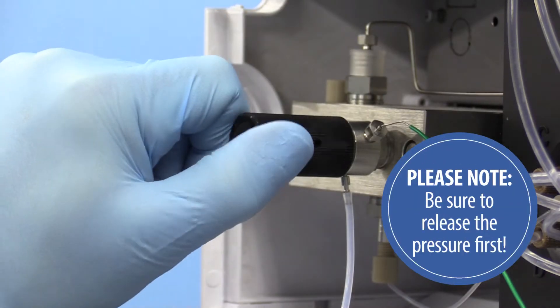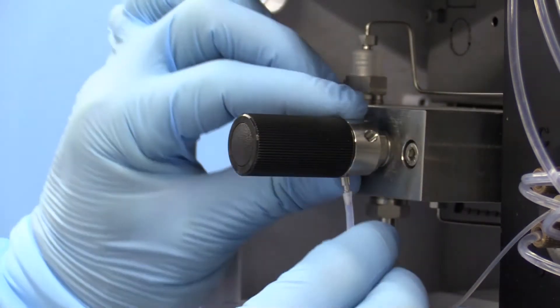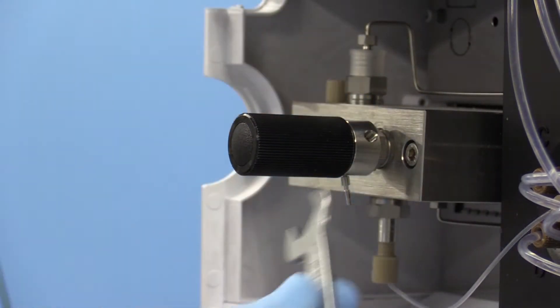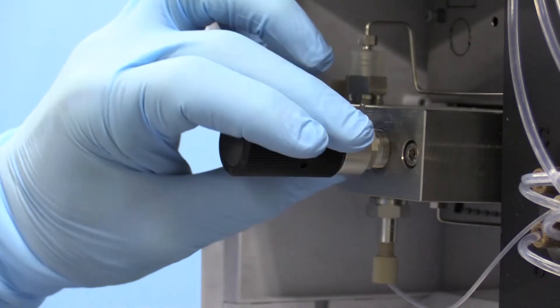First, open the purge valve to release the pressure, then remove the outlet capillary and drain lines. Next, unscrew the valve with the 14mm flat wrench provided in the pump accessory kit.